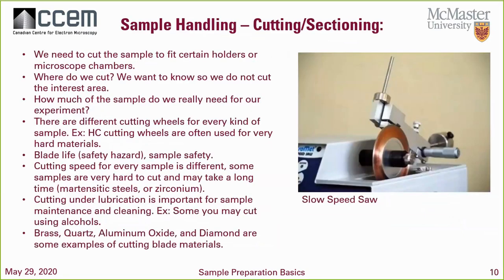I want to talk a little bit about cutting and sectioning. We need to keep in mind that the sample has to fit certain holders and certain chambers, so we have to keep that in mind. What's the standard size? We're going to go to the technician. In this case, let's say you go up to Chris and ask Chris, what's the size of the SEM sample that I need to cut? He'll let you know. You'll have to make sure that we cut it to that size.